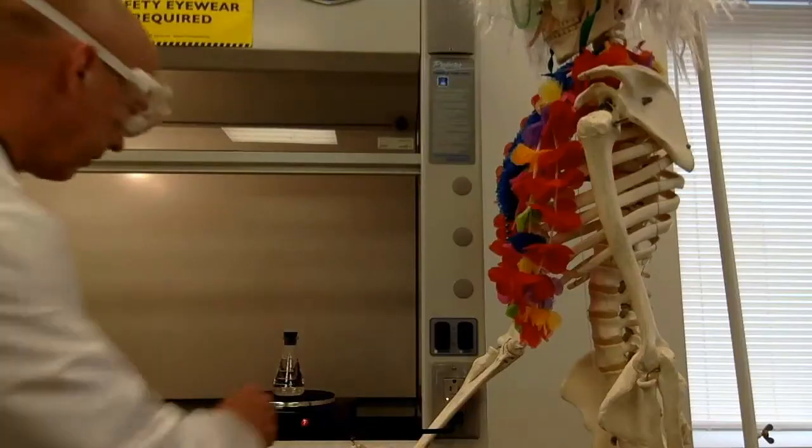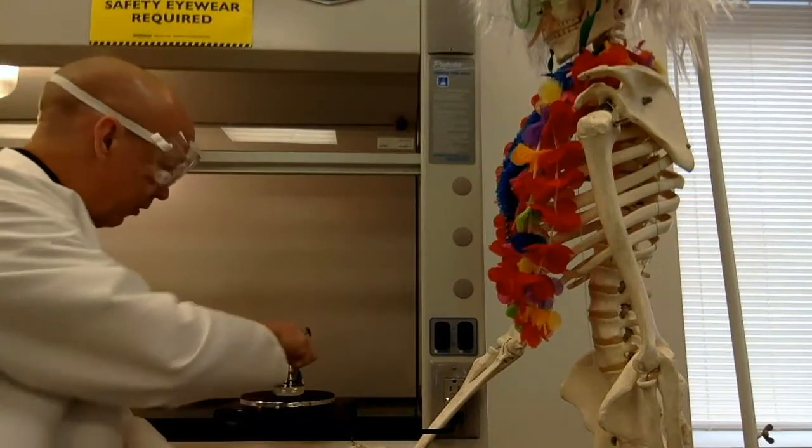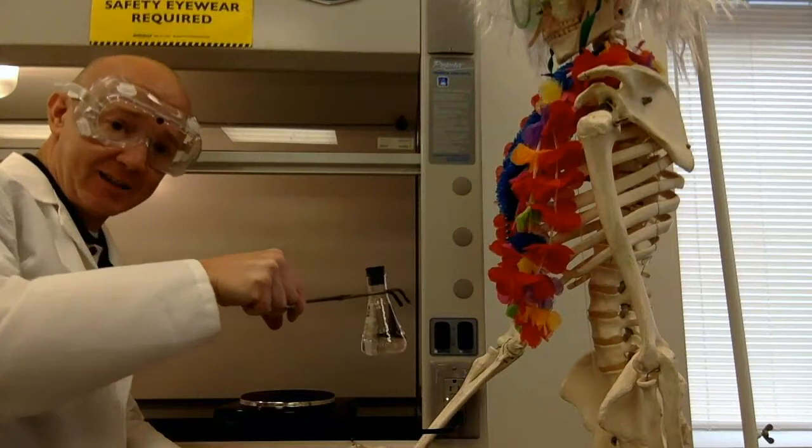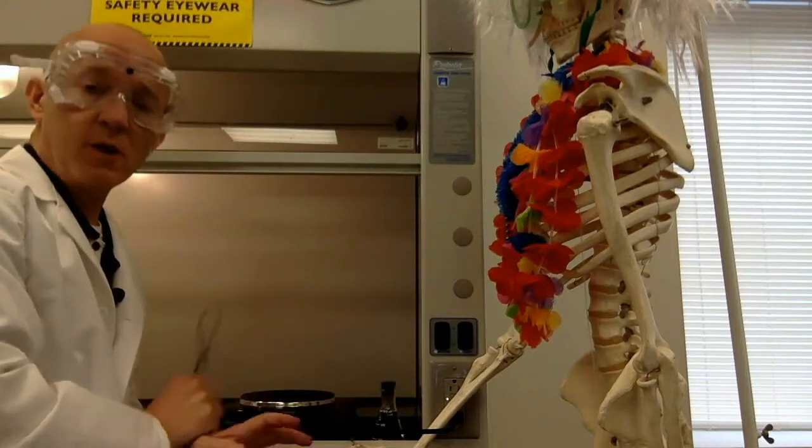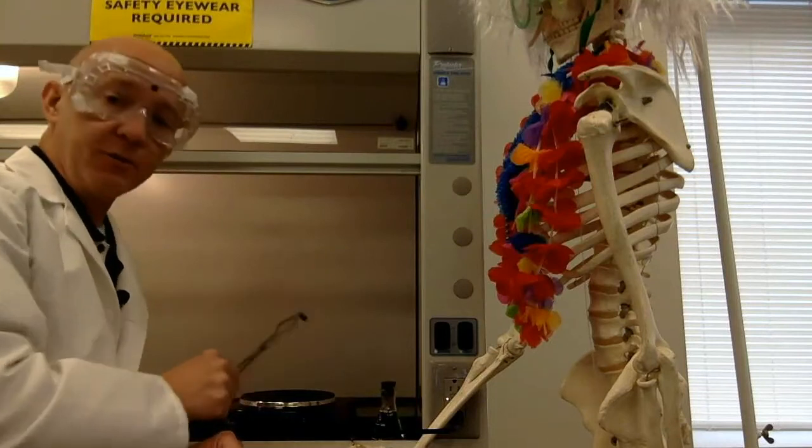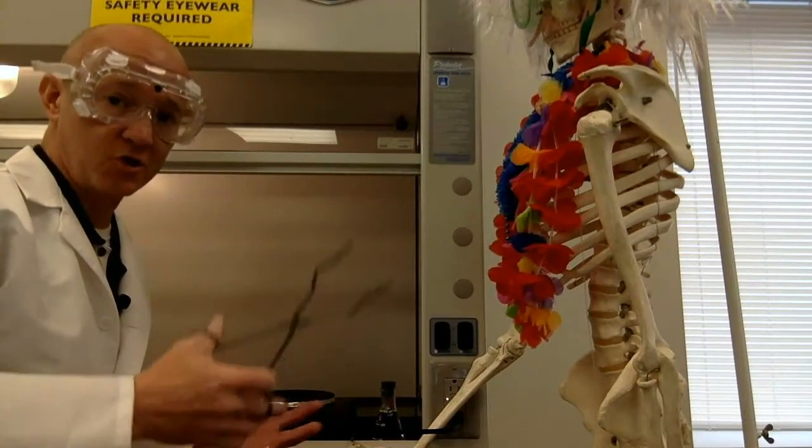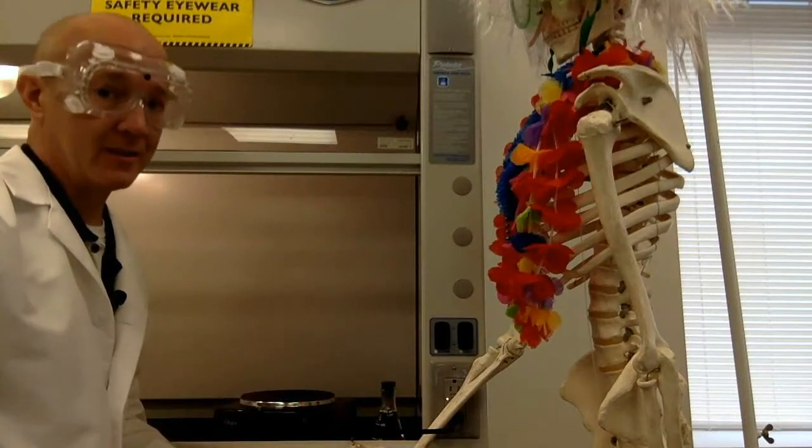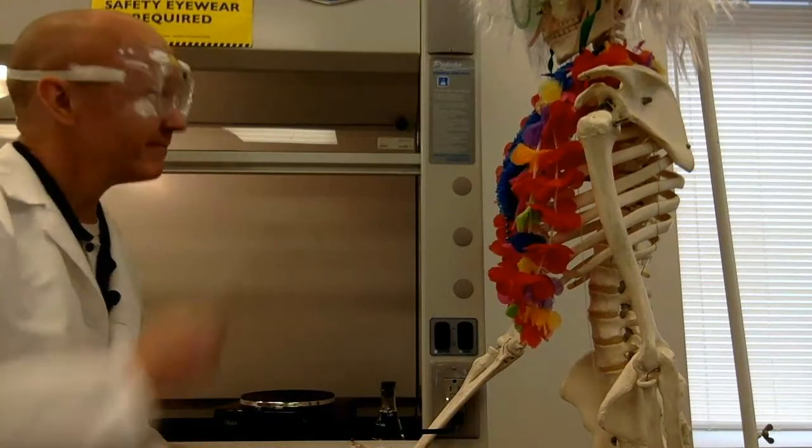Oh, Slim, are you crazy? Look, we never, ever heat a sealed flask like this on a hot plate or on a burner or anything. That sealed flask could build up pressure and eventually burst, and that could cause shards of glass to shoot out. That's bad. We don't want shards of glass in the laboratory. Come on, man.